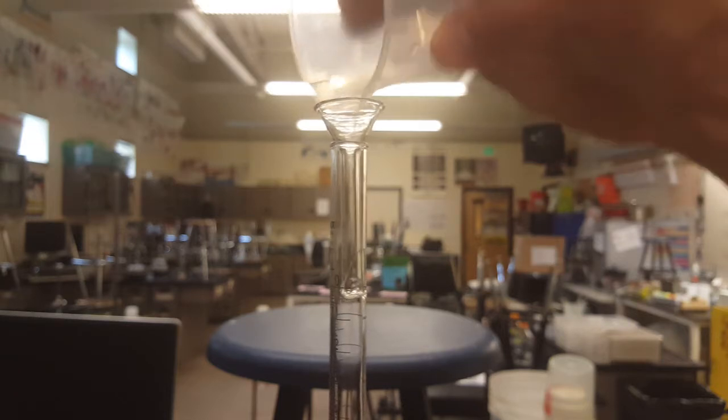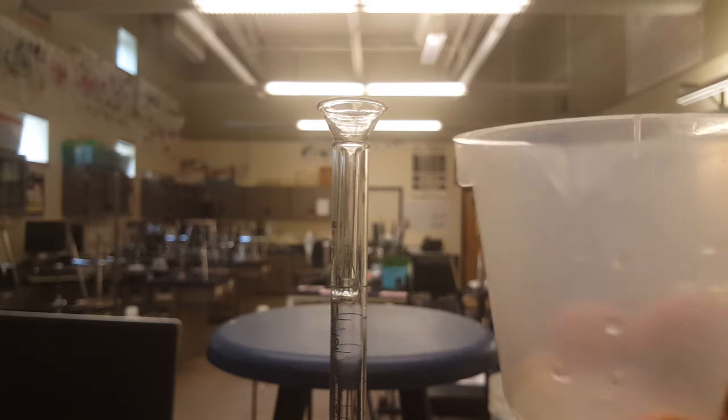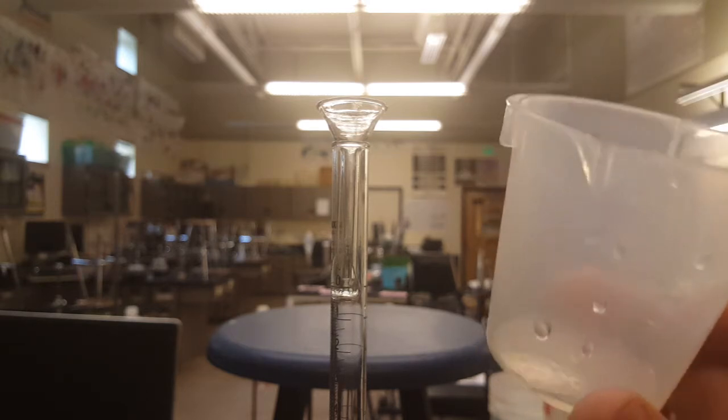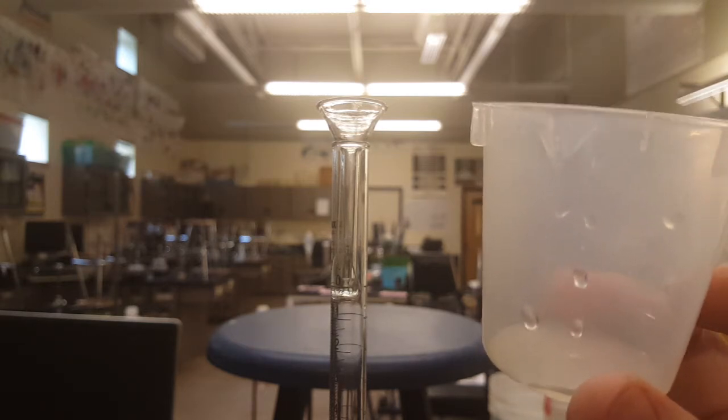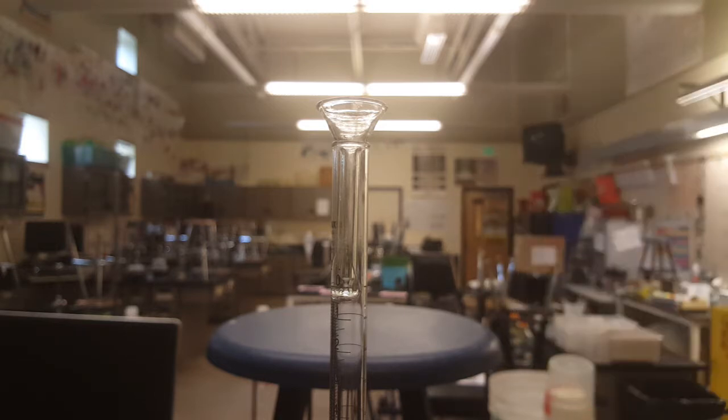And as soon as you've poured your base into the funnel, take this cup over to the sink, spray it with vinegar, and then wash it out and dry it for the next period.